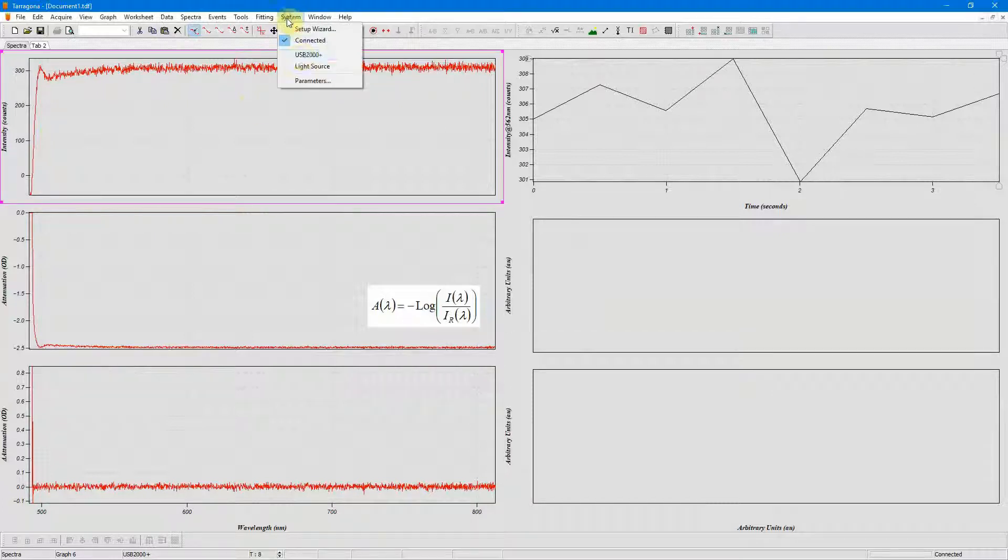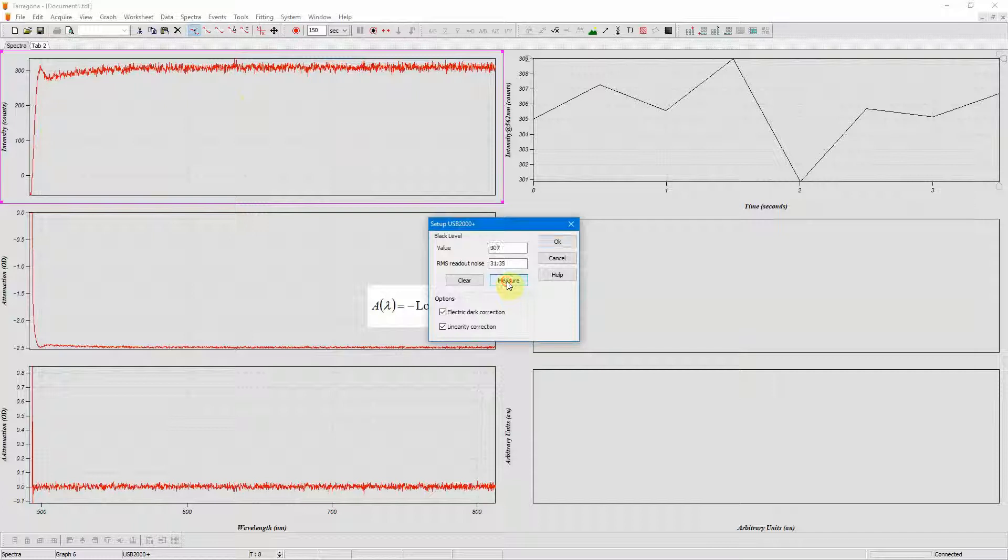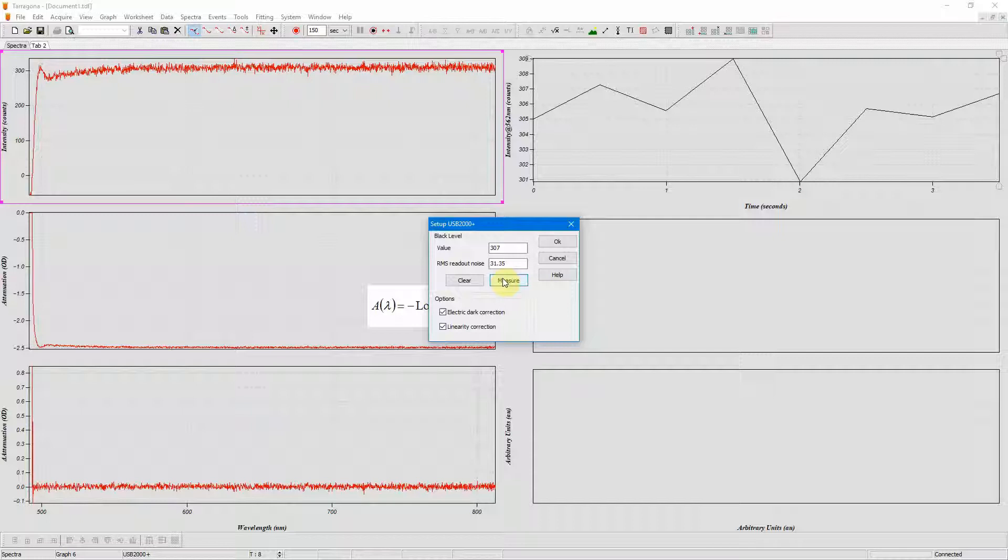To do that I go into the system menu and the setup for the USB 2000 and I click the measure button. That will collect 30 spectra with a very short integration time and then average them and store them as the black level. It also gives me my readout noise at the same time.